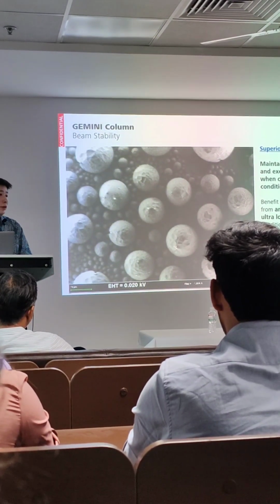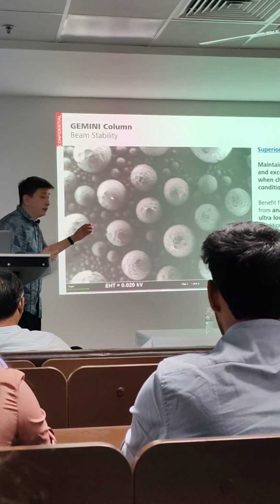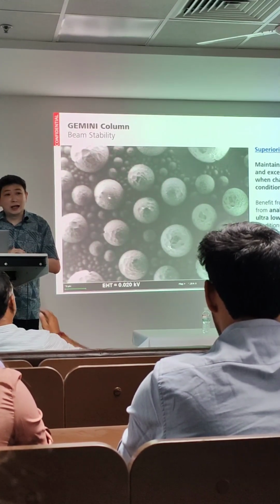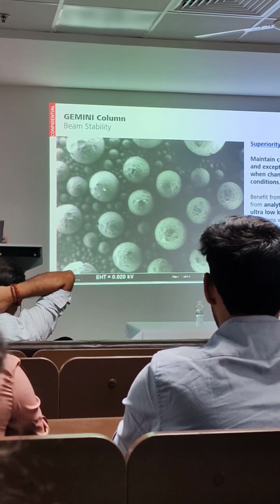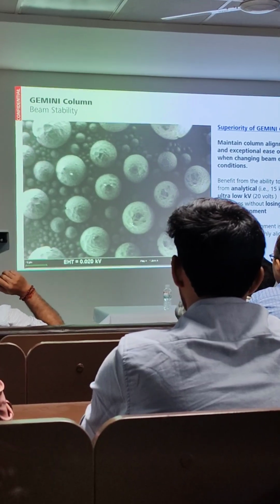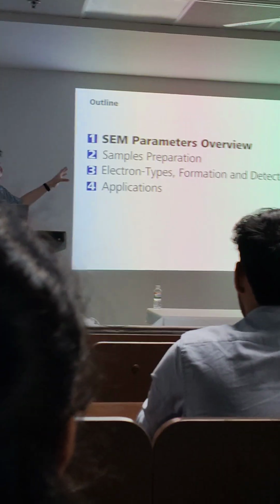Nowadays we publish a lot of papers and the question is, can you show me the surface details? How do we get it? This method. Alright? I hope these two videos as an introduction really capture your attention, how powerful the machine is. So I will go through these materials, parameters, right?